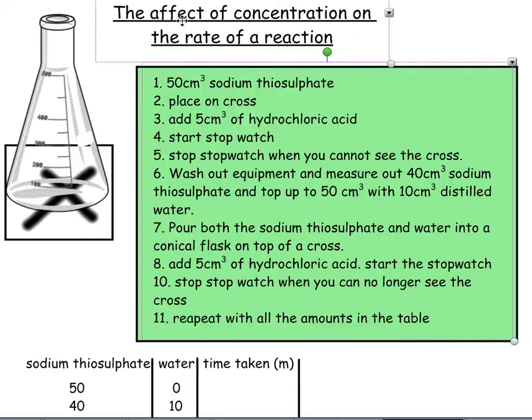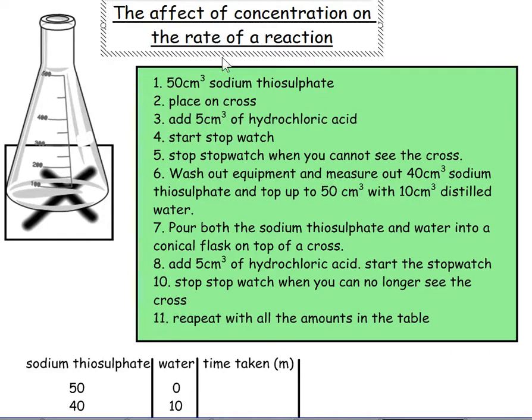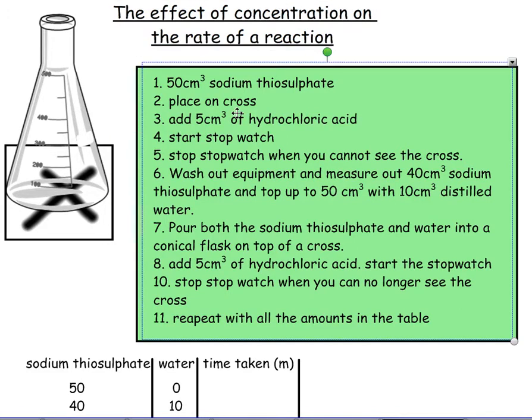Okay, the effect of concentration on the rate of reaction. Now look at the conical flask just there, so you didn't notice I'd changed that, that's fabulous. Right, here we're doing the same reaction as we did with temperature, but this time we're changing the concentration of one of the reactants.